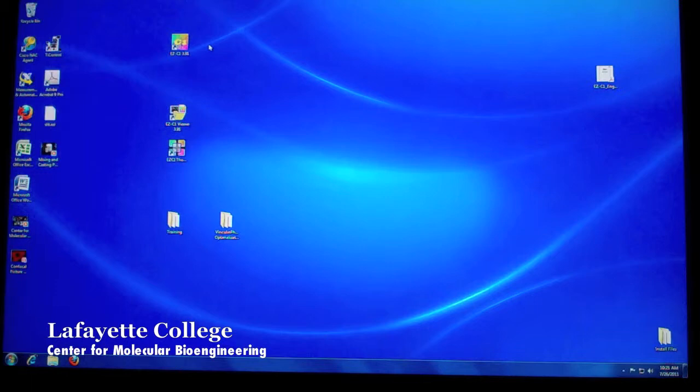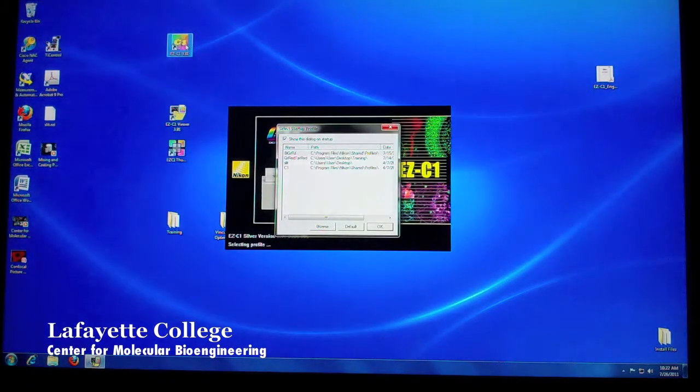This is the video tutorial for confocal imaging using the confocal microscope. Please refer to the fluorescent imaging tutorial to get the sample in focus. Before imaging, make sure the lights are turned off. Double-click the EZC1 3.91 icon on the desktop to open up the confocal software.